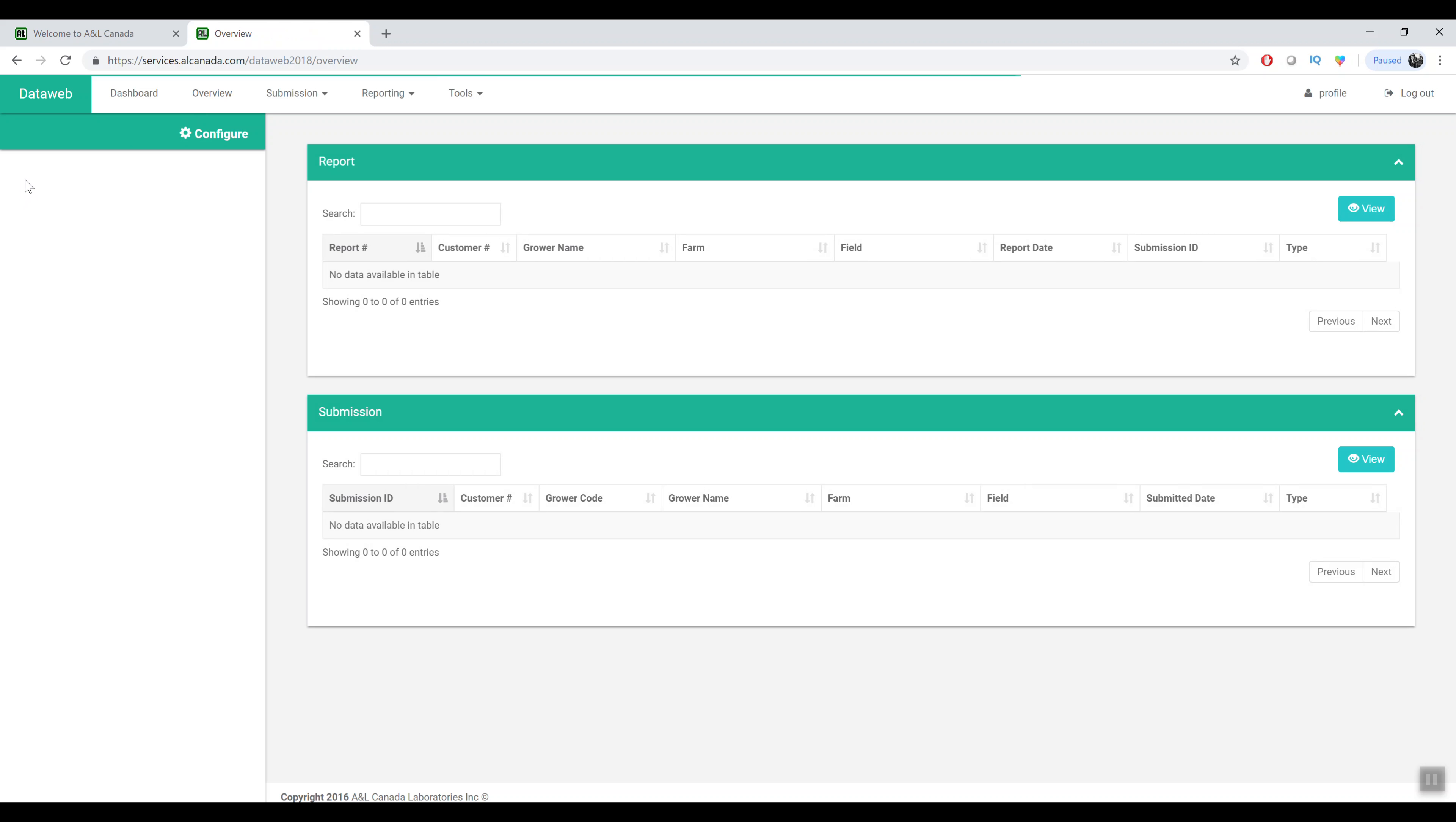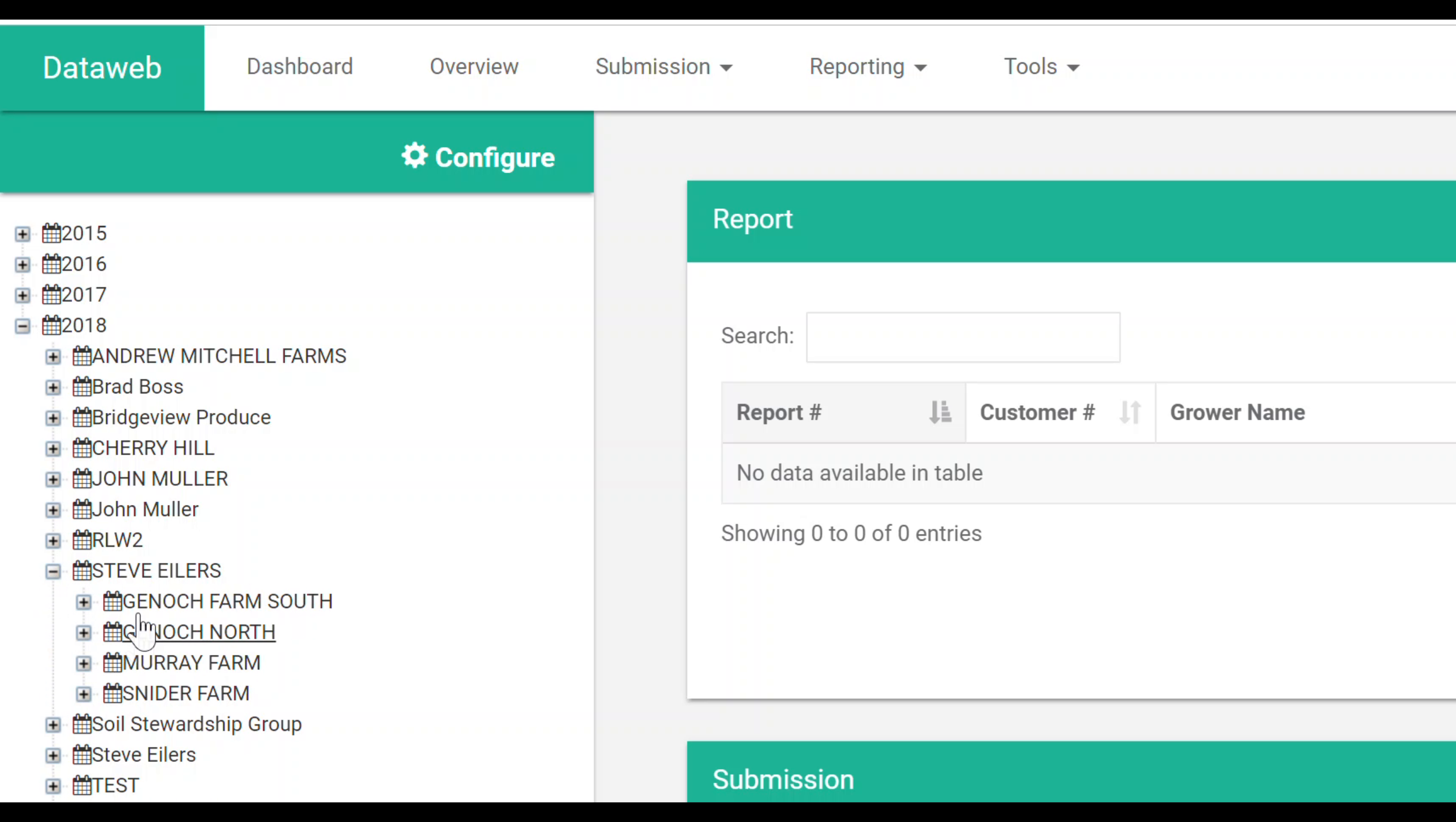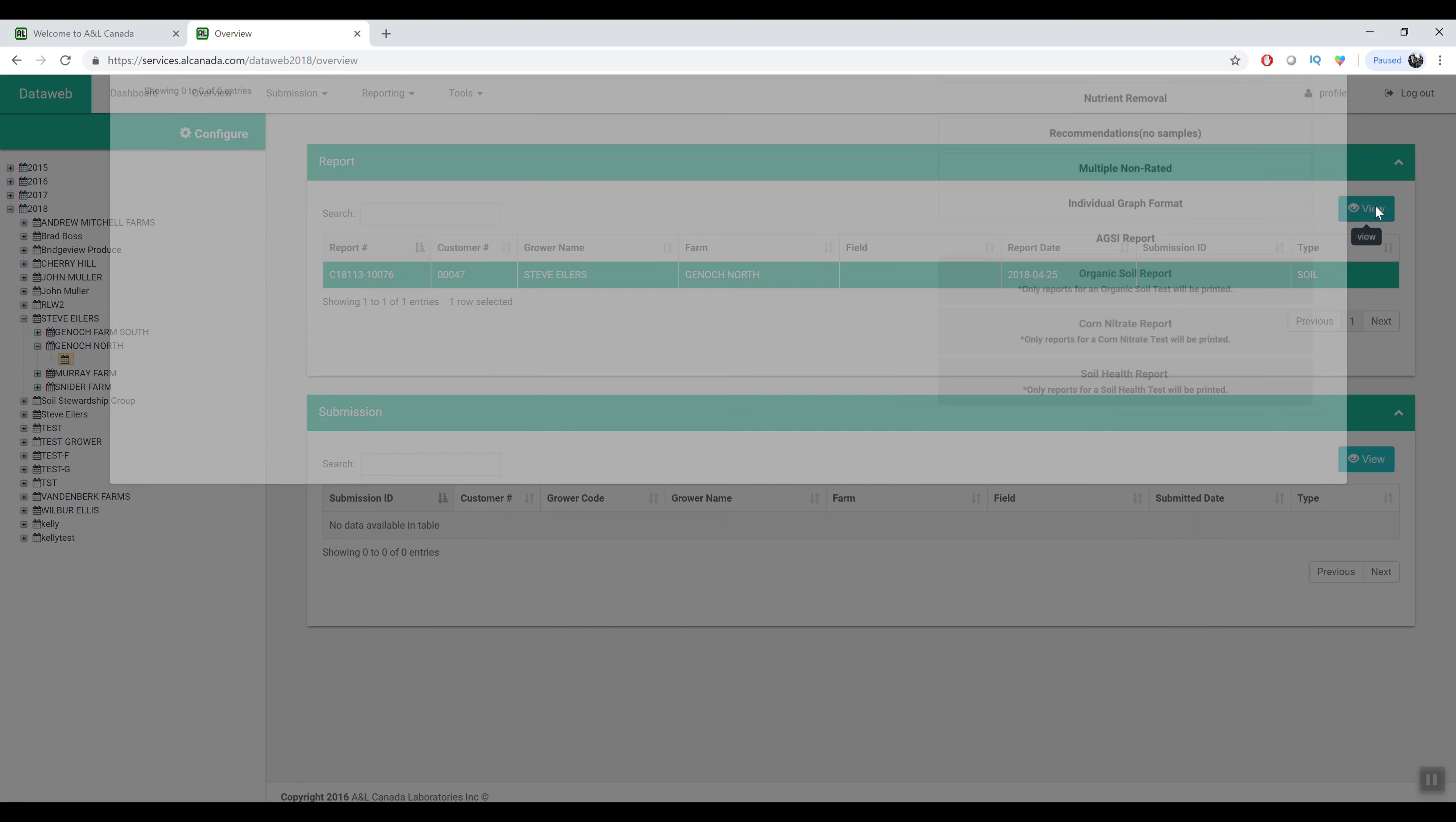We also have an overview tab now that lists all reports and submissions in the system by year. It's sort of a tree format here and you'll see growers and farms and if they have fields underneath there as well.